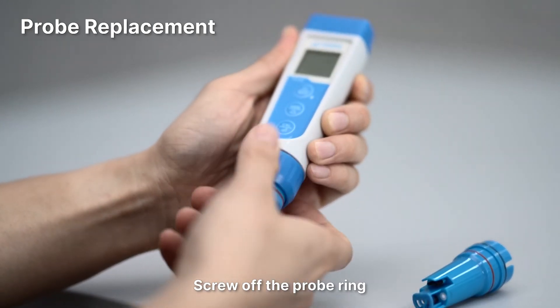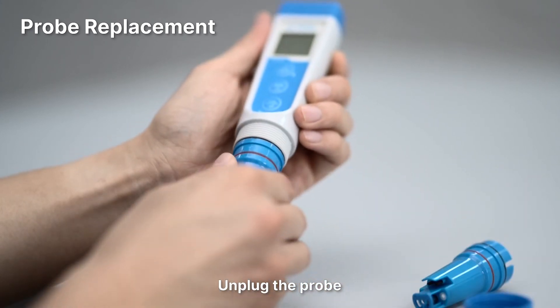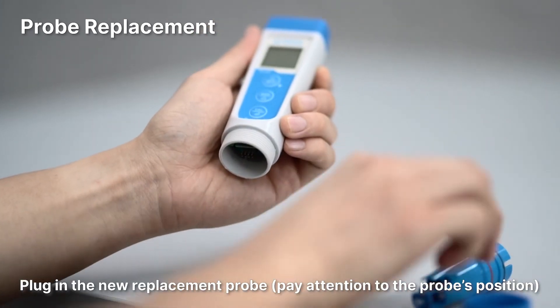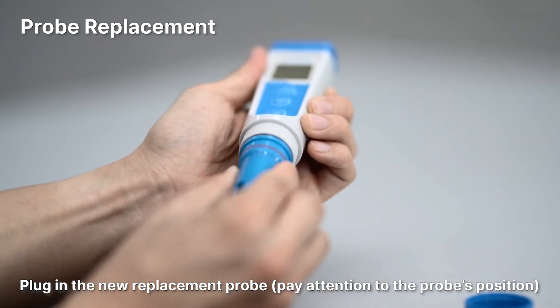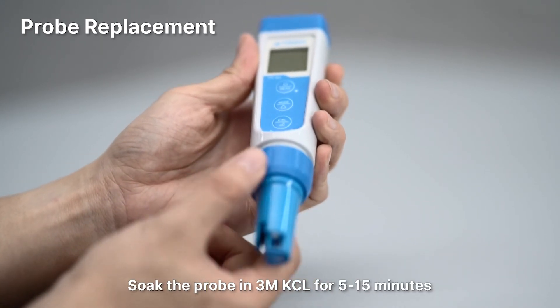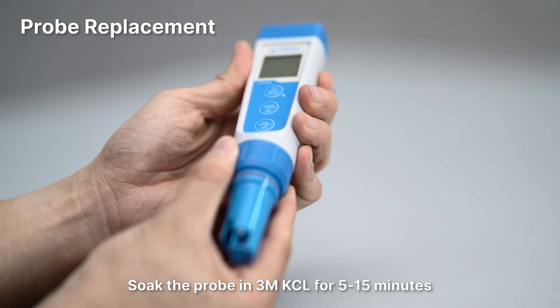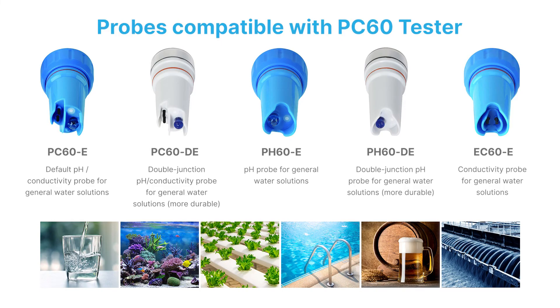Probe replacement: Screw off the probe ring. Unplug the probe and plug in the new replacement probe. Pay attention to the probe's position. Screw on the probe ring tightly. Soak the probe in 3M KCL for 5 to 15 minutes, then perform calibration before testing. This probe is compatible with the PC60 Tester.